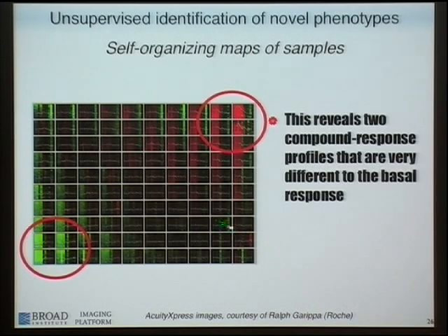If you happen to know that everything here is kind of typical, this is where your negative controls lie, maybe this is the phenotype you were looking for in your screen, by looking at this kind of visualization, you may notice, hey, there's this other group of samples that has something I maybe wasn't expecting, and that would be the basis for further exploration.